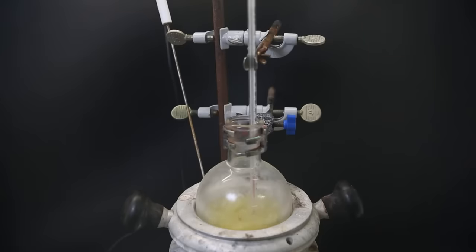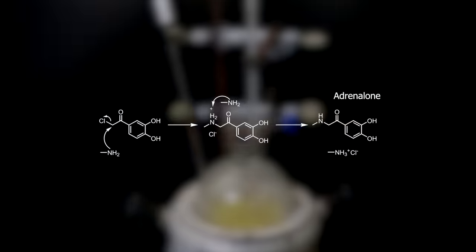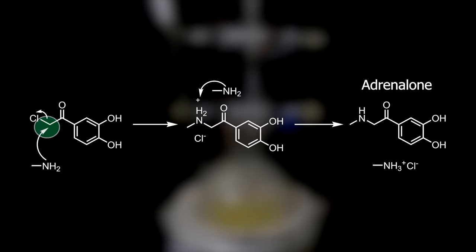When all of it has been added, I move it out of the ice water bath and into a heating mantle and then heat it to 35°C and leave it to stir for three hours to make sure that the reaction is complete. In this reaction, the amine from methylamine attacks the carbon adjacent to the chlorine, causing the chlorine to be kicked off. The resulting intermediate is deprotonated by another methylamine molecule, forming methylamine hydrochloride and the product, adrenaline.